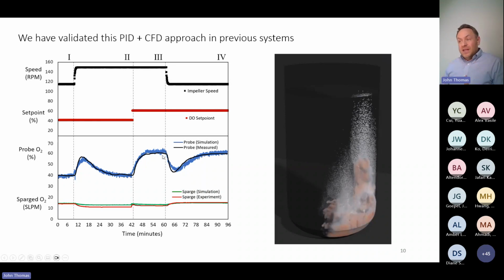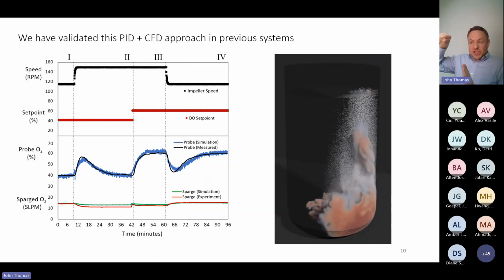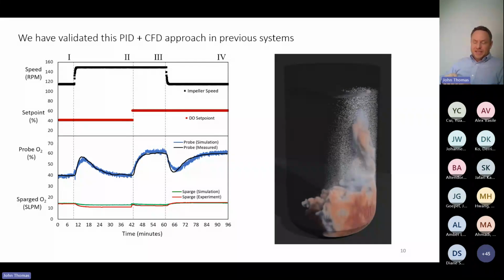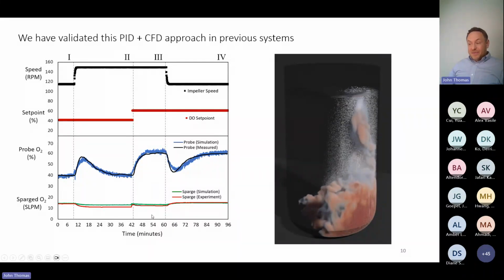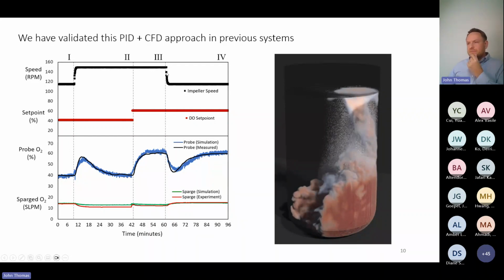And this is really cool. Let me reemphasize this point. The simulation correctly predicted how long it would take for the physical system to respond to this change in state. And in terms of the flow rate, it's getting the right answer, the response time, for a pretty good reason, as it were, in terms of what we think the steady state flow rate should be.